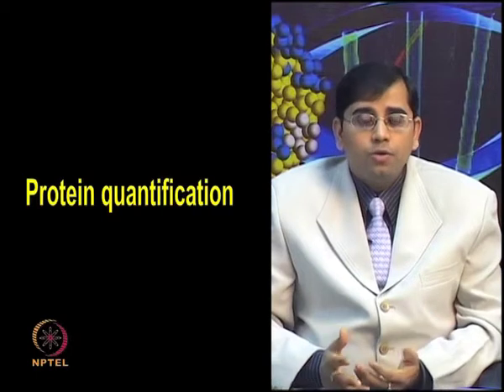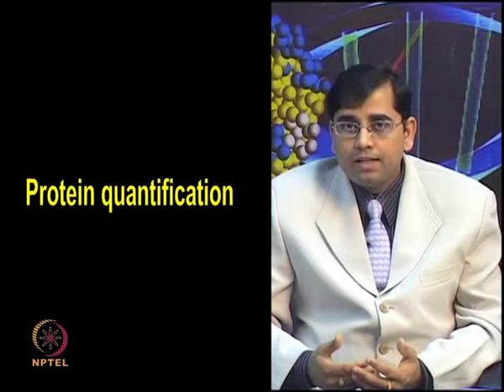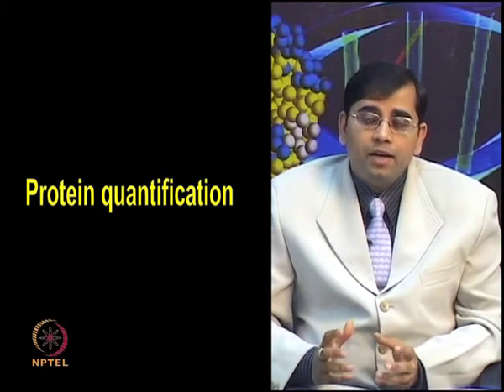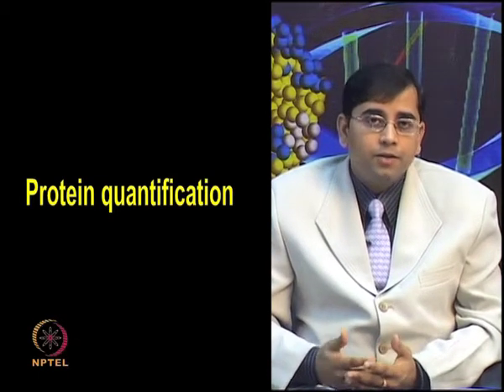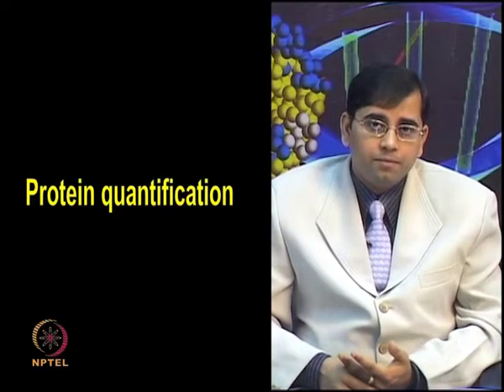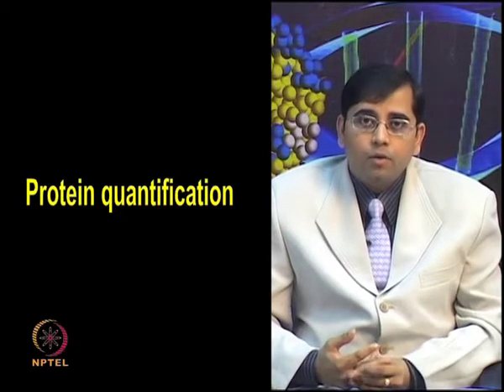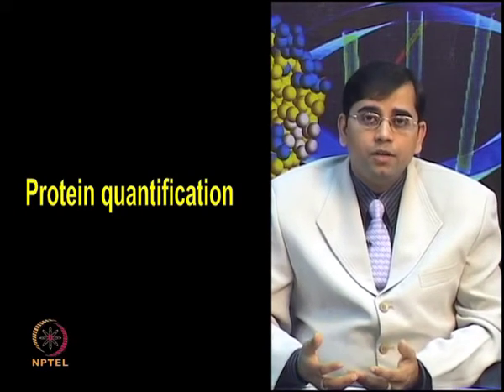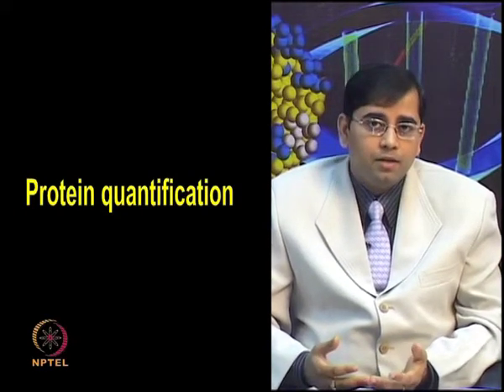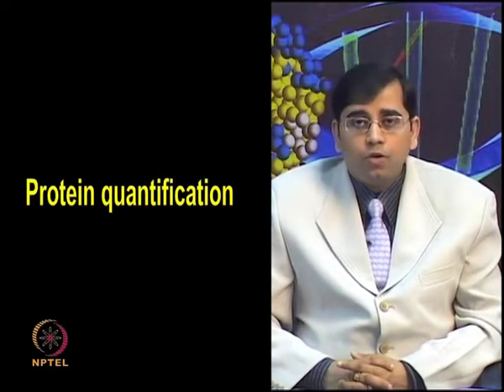So, by now you have prepared your protein sample using different types of methods, keeping a very careful eye on different types of interfering substances and contaminants, and you try to eliminate all of those components. Now, you want to know how much protein you have in your sample, whether you can perform your experiment with that protein or not. So, one needs to know the protein quantity present in the sample. There are different protein quantification methods available. We will talk about protein quantification in detail now.